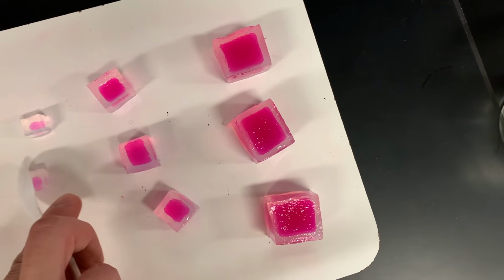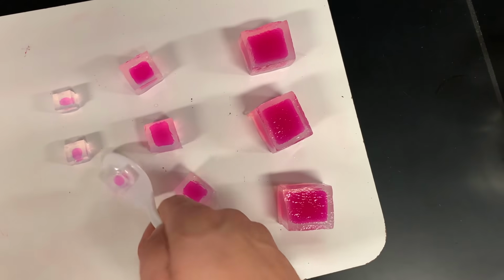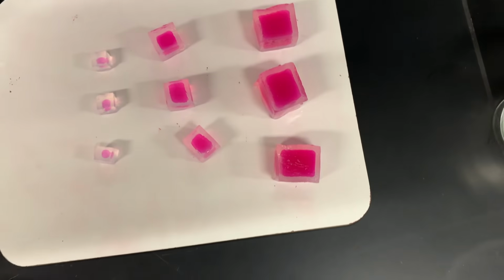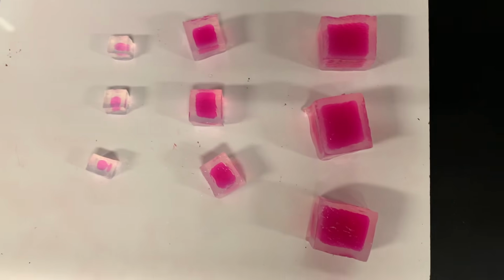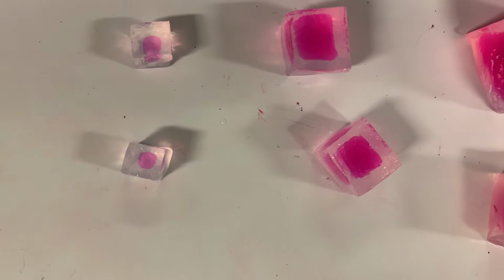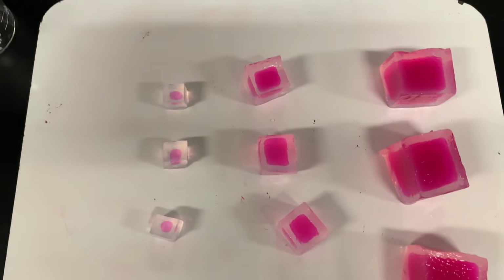So there is some hydrochloric acid, like I said, guys, still on our cubes, and they all have it on there. So we can still count this as not being a variable, because they all have hydrochloric acid on. If you notice the 1 centimeter ones, the pink got even a little bit smaller as we were transferring them over. This is just because there's more hydrochloric acid seeping into the cubes.